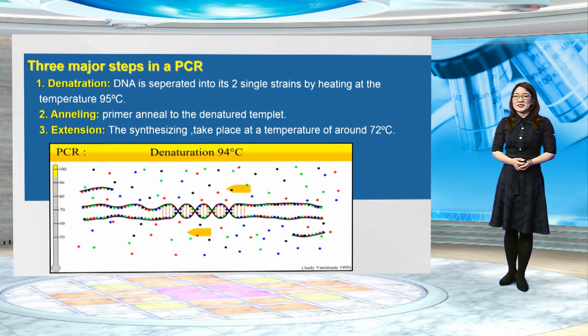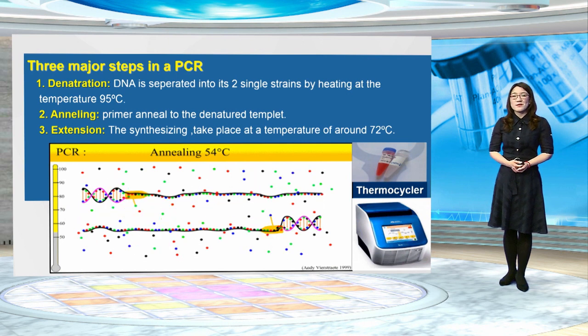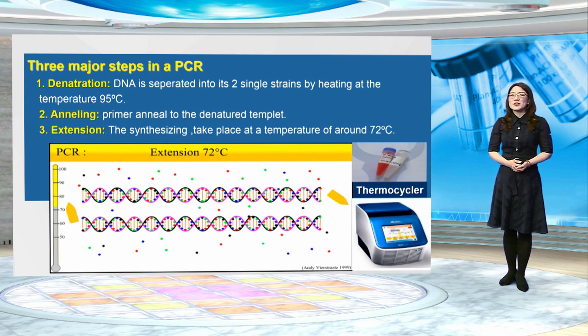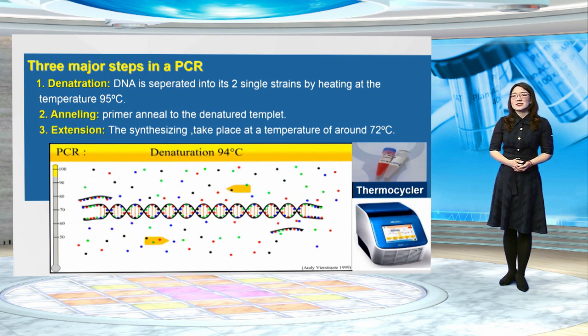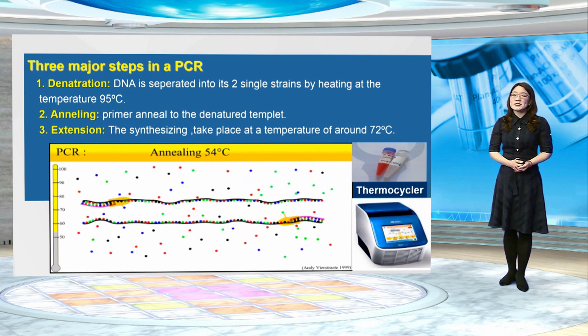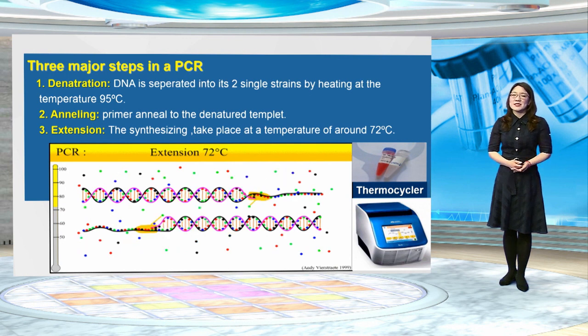Each PCR consists of 3 steps. At the start of the process, all reaction partners must be single-stranded, which is achieved by heat denaturation. We call it melting. Subsequently, annealing of primer molecules to the template DNA.